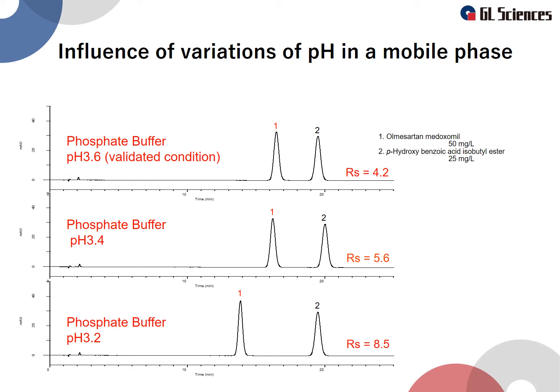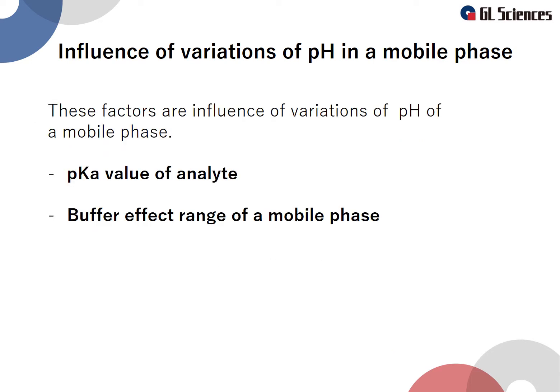It is important to confirm a new method using several different pH values. The pH of the mobile phase is influenced by the pKa value of the analyte as well as the effective buffer range. We will explain these two effects.